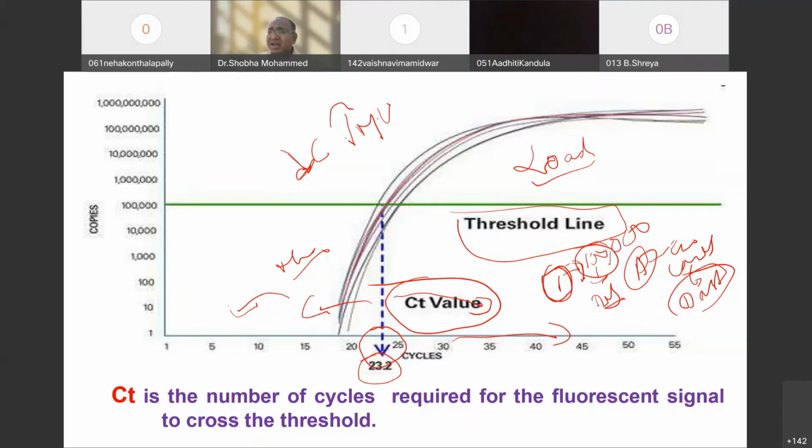How am I detecting an antigen? Because it follows the sequence of the DNA molecule arrangement. That's what I am finding out first here. So that's why I have denaturation, then synthesis of that particular molecule. And then, it means that the DNA which is being present, not one DNA I am giving in the fluid. When I collect the sample from the nose or from the throat, it contains the plenty of the bacteria. Got the point here? So I do that isolation of the DNA.